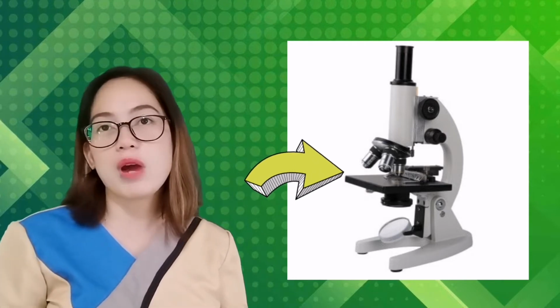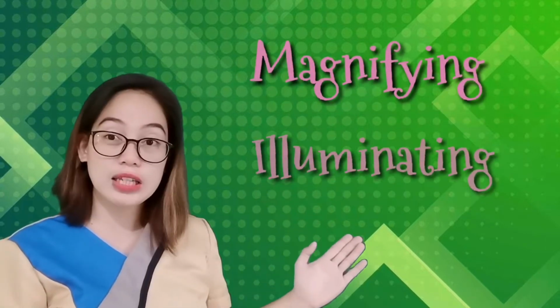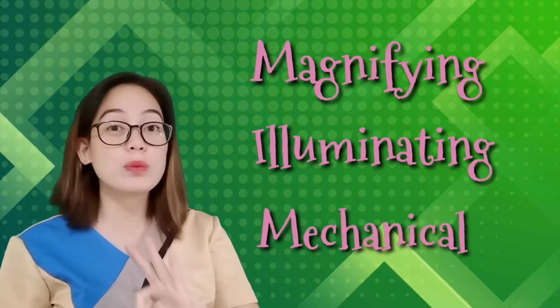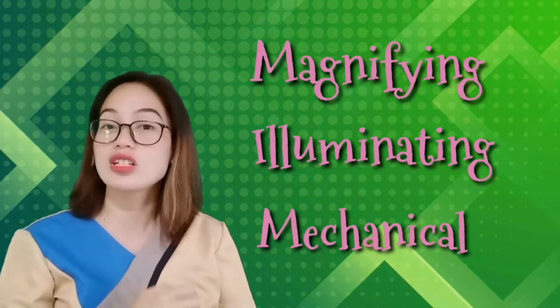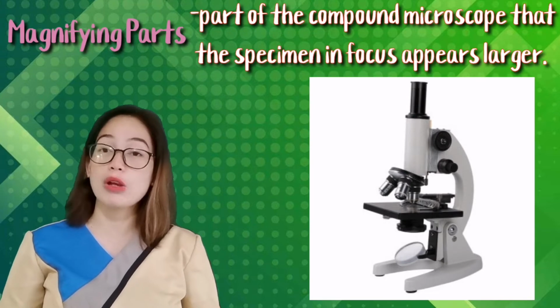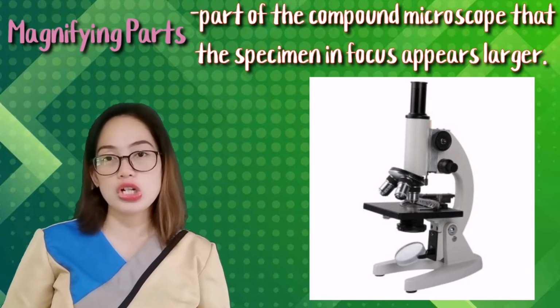The compound microscope comprises three major parts: the magnifying parts, the illuminating parts, and the mechanical parts. These three major parts are also categorized into subparts. So let us go first to the magnifying parts. They are the parts of the compound microscope that make the specimen in focus appear larger.